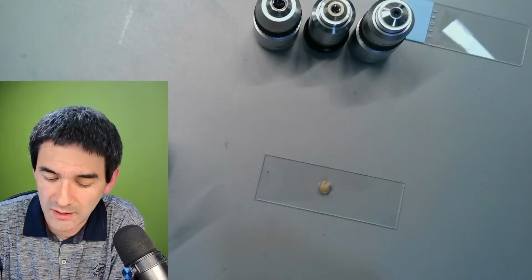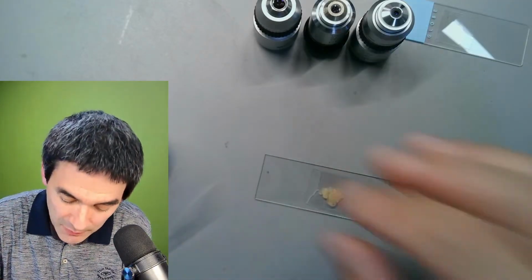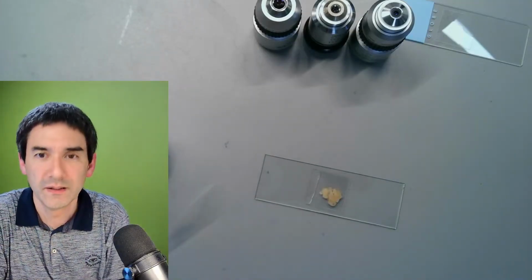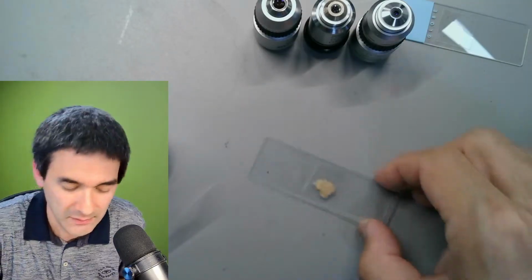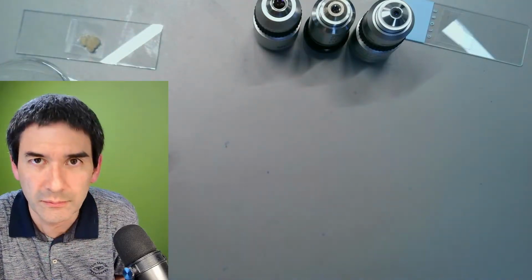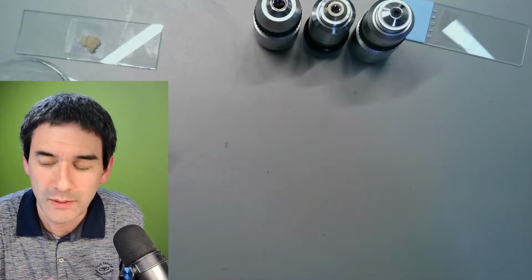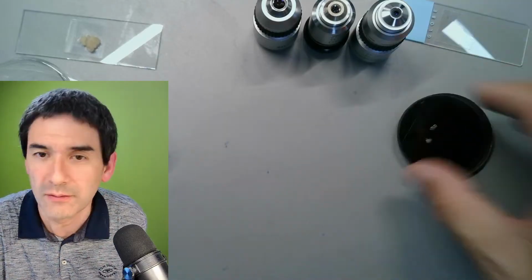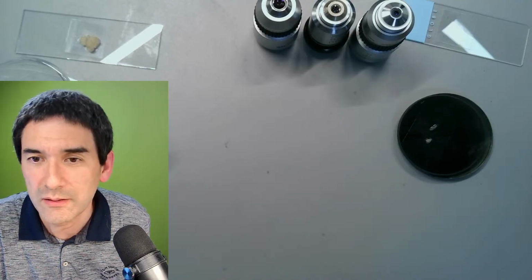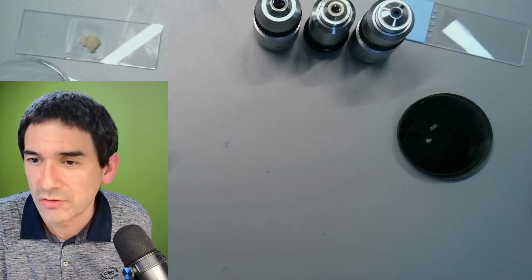Or worse yet, they do something like this, and then they just slap it on a microscope like this. No, that's not how you prepare a specimen. Why even bother making videos like this if you don't want to show it properly? Maybe I'm being a little too nasty here, but as someone who's trying to educate, it's a little bit frustrating for me. That's just my comment.